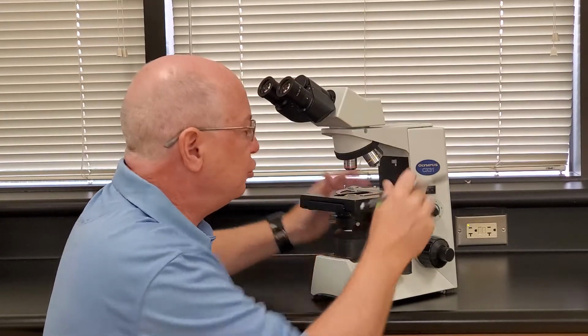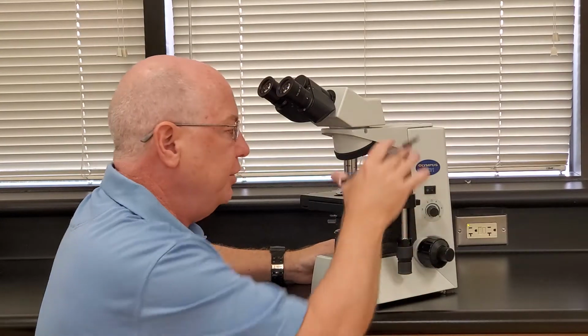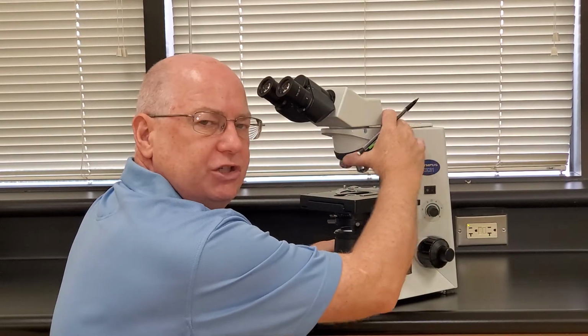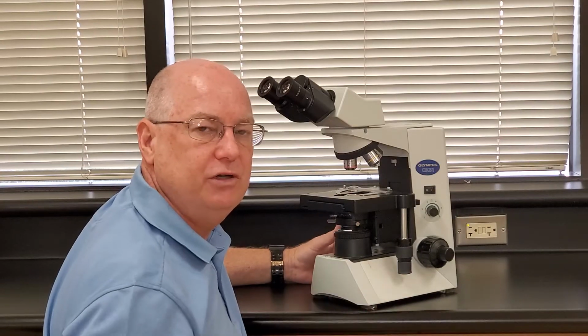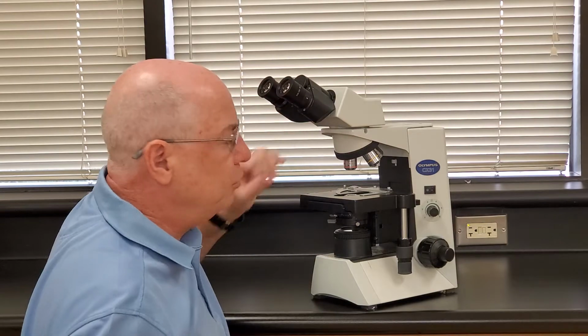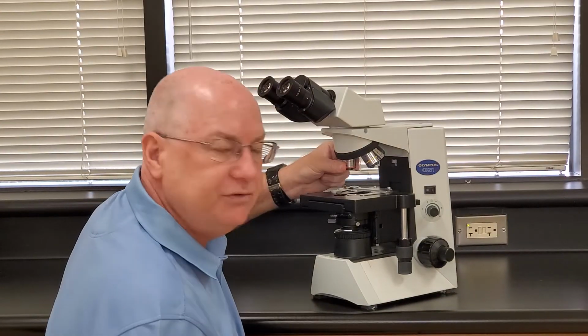Now, sometimes that's good enough. Students always want to go to the highest power objective, and you don't always need to do that. You need to look at all 3 magnifications and decide what is the best magnification for whatever slide you're looking at, okay? And when you do turn the revolving nose piece, don't grab the objectives and turn them.